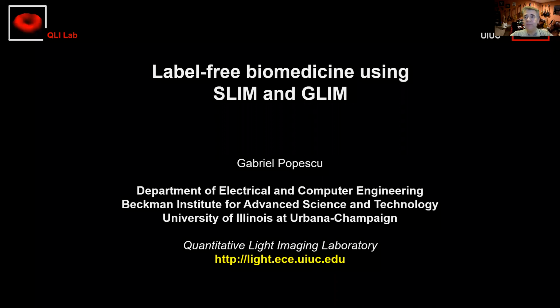So we came up with a method that I didn't have time to show here. Imagine if the phase image is like a density map, a continuous map, we are able to now extract transport information of that continuous mass. So it's not just discrete particles, but imagine it's like a fluid with inhomogeneous density that is transported back and forth.